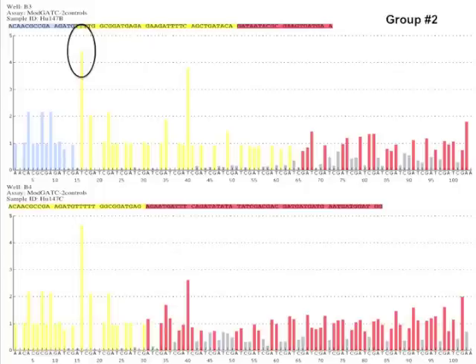But if we look at the corresponding peak, we've called out about 4.5 Ts for that location. So there is a difference there, although it's not a huge difference, so I'm going to put a question mark there because I'm not sure how much of an impact that is really making on the reproducibility of this particular method.